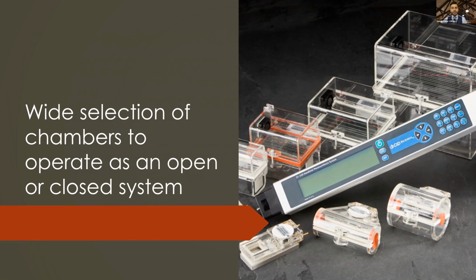Now in the closed systems, a leaf or other matter is enclosed in the chamber itself. It's sealed to avoid gas exchange with the atmosphere, and the rate at which the carbon dioxide and relative humidity concentrations change in the chamber is monitored. This is determined based on leaf area and the leaf chamber volume. And complete equations for photosynthesis and transpiration are all available online at our website, again, cid-inc.com. Now let's go over a few of the chamber options that we have available to us.